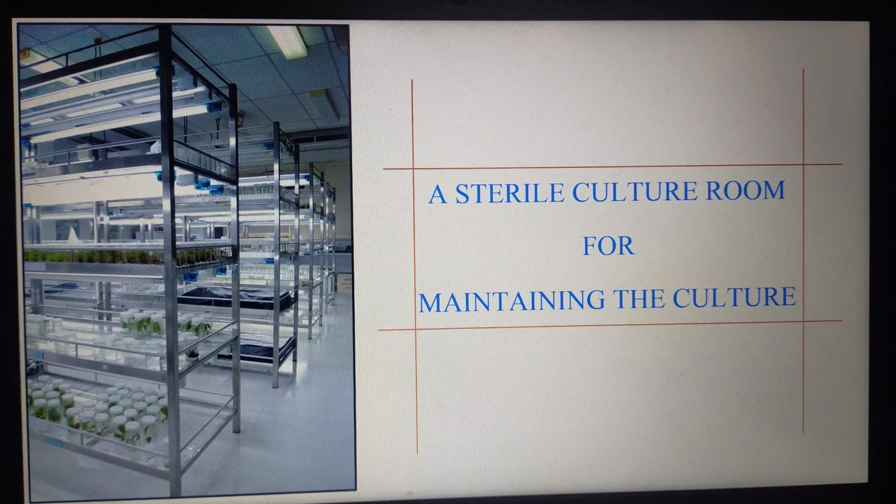And this is another room with regard to plant tissue culture, what we call the sterile culture room. This is the culture room. Once the explant is transferred to the culture medium, it is transferred to this room, which is called the culture room.